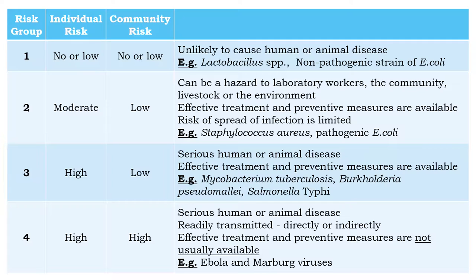Risk group 3 organisms have a high risk to the individual and a low risk to the community. However, they can cause serious human or animal disease, and effective treatment and preventive measures are available. Examples include Mycobacterium tuberculosis, Burkholderia pseudomallei, and Salmonella typhi. Risk group 4 organisms have high individual and community risk; they can cause serious human or animal disease which may be readily transmitted directly or indirectly, and effective treatment or preventive measures are not usually available. Examples are Ebola and Marburg viruses.